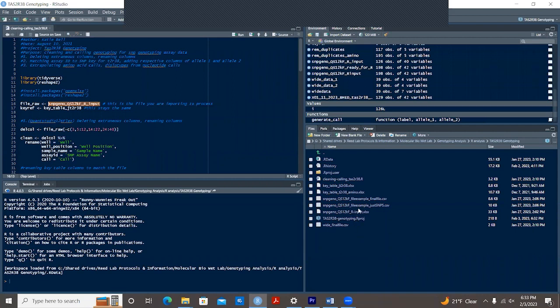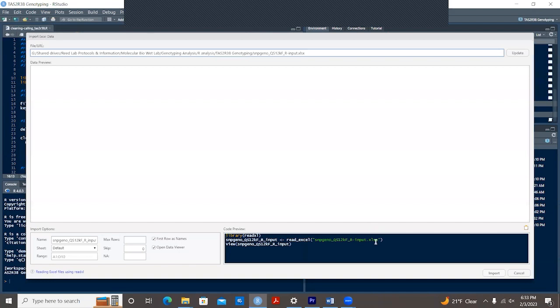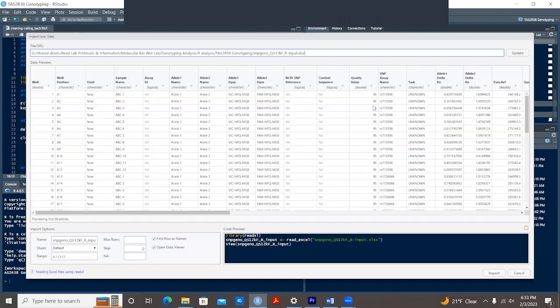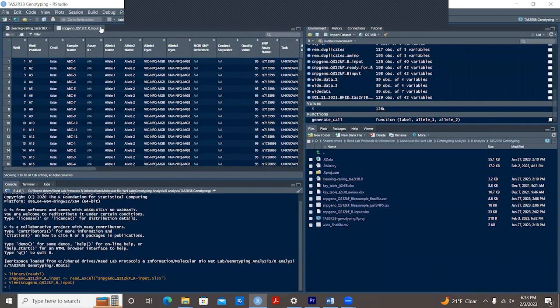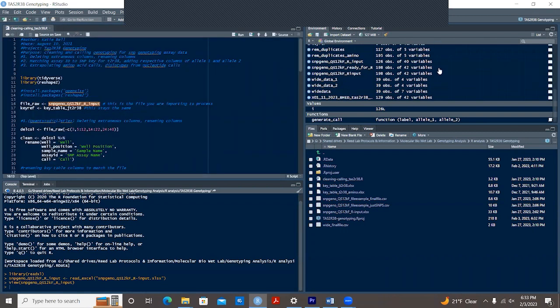And we're also going to import the file because I'm going to pretend that I haven't put this file in the system before. So if you had just copy and pasted in your file, now you're going to import it. Now it exists in our directory up here. And I'm going to make sure this is the right file. Yes, that should be correct.